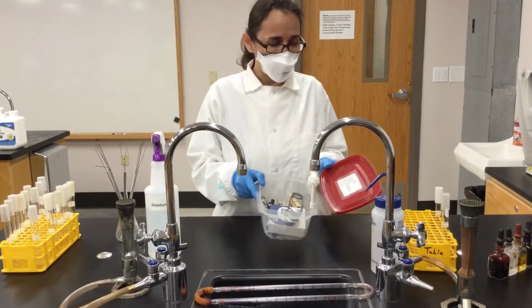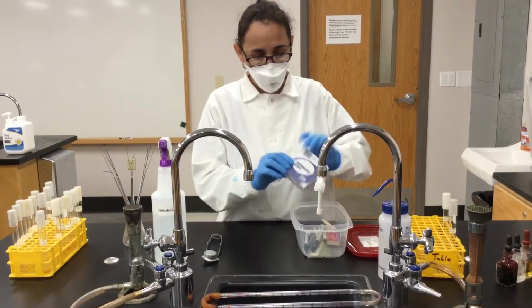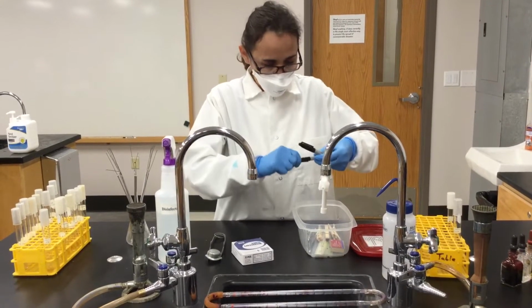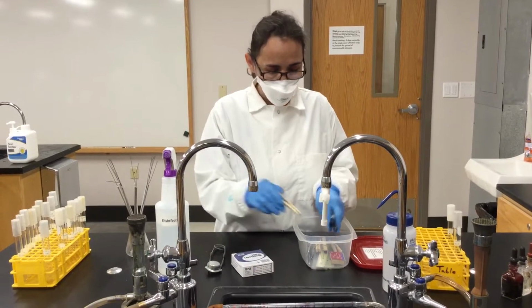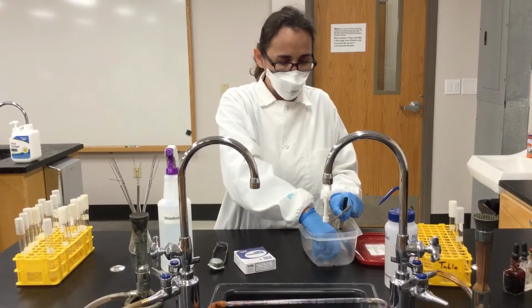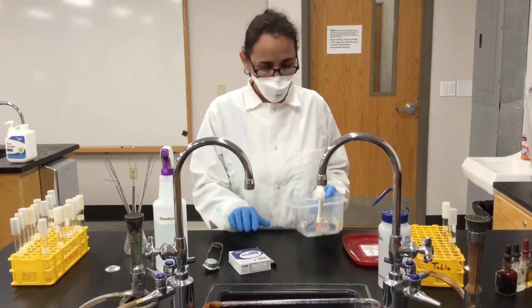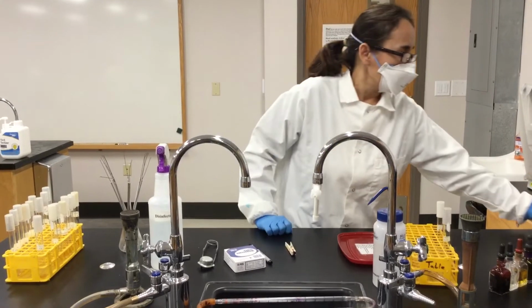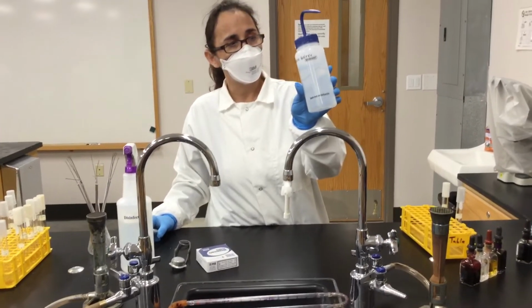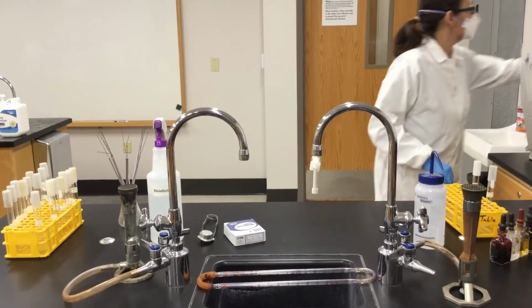Now, here you will have your container with different items that you will need. You will need a lighter for turning on the Bunsen burner. Then you will have your microscope slides. These ones are matches, you don't need them. You have some Sharpies, and some clothespins so that you can manipulate your slides. And then you have scissors, some rulers and some tweezers. But for the stainings, you will use your marker, your microscope slides, and one of these. Then you will have everything, and also your squirt bottle so you can wash your slides when you're doing your techniques. And I'm going to grab a piece of paper towel to start cleaning this area.